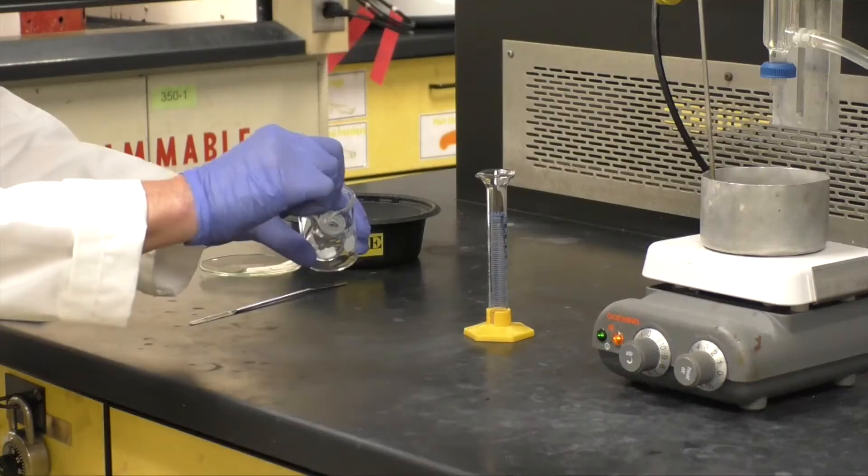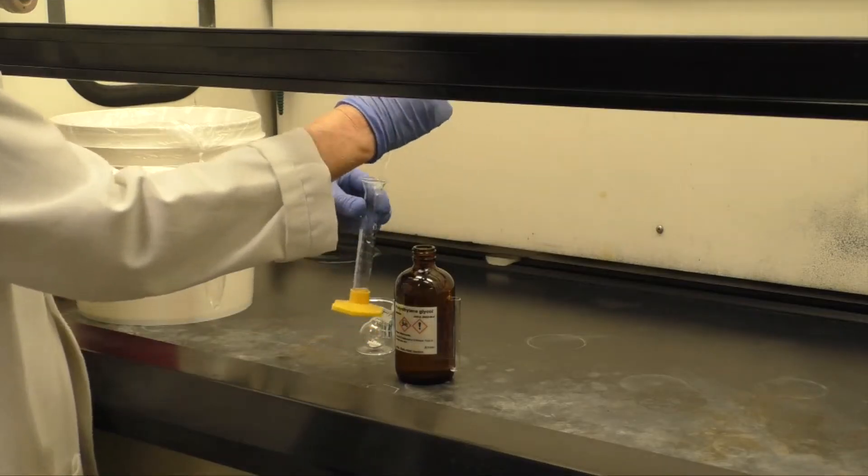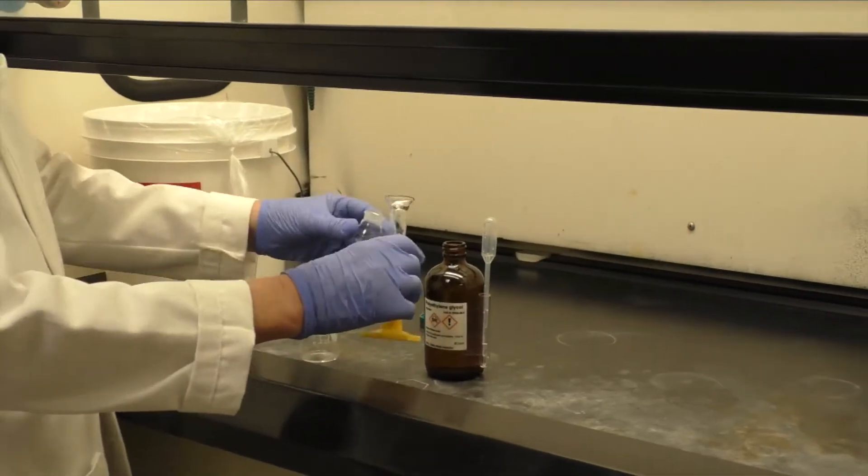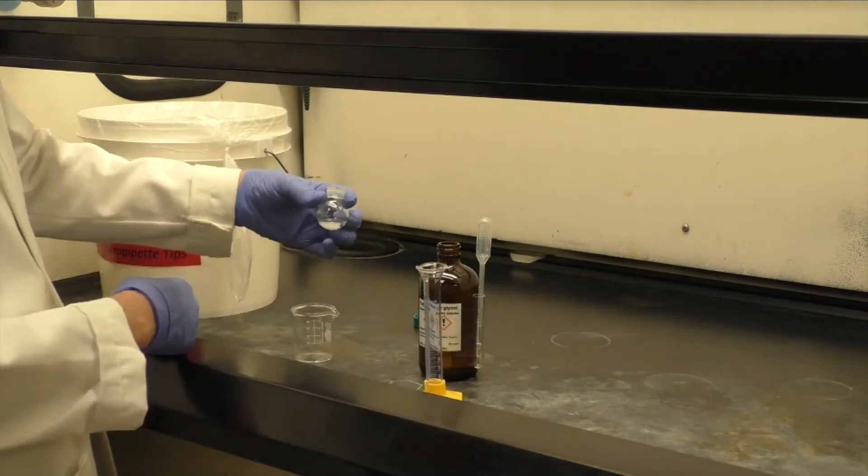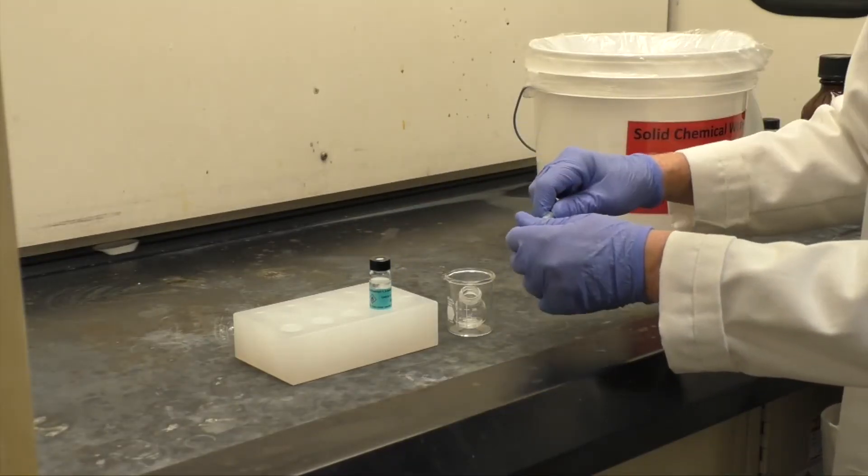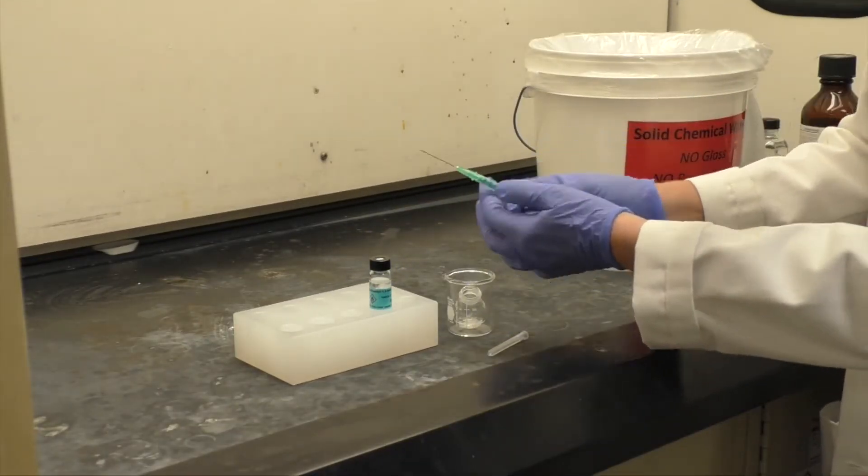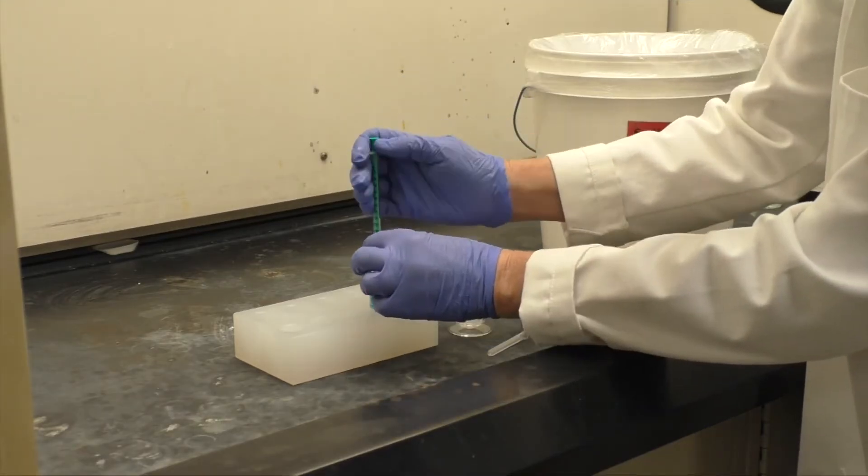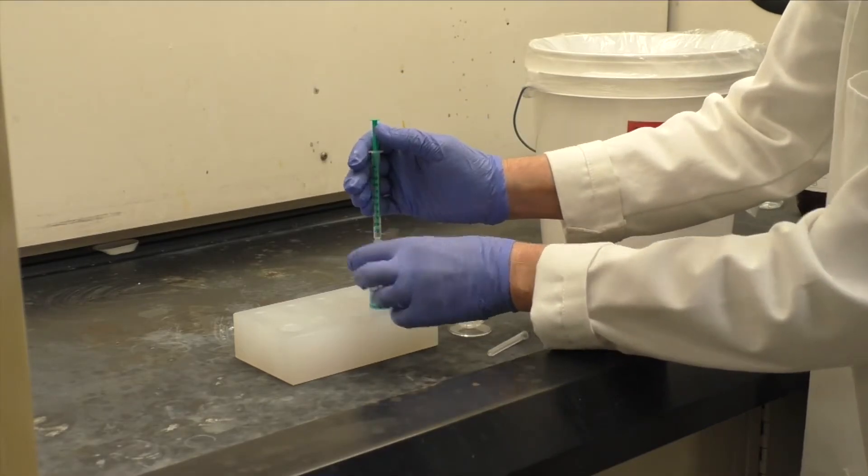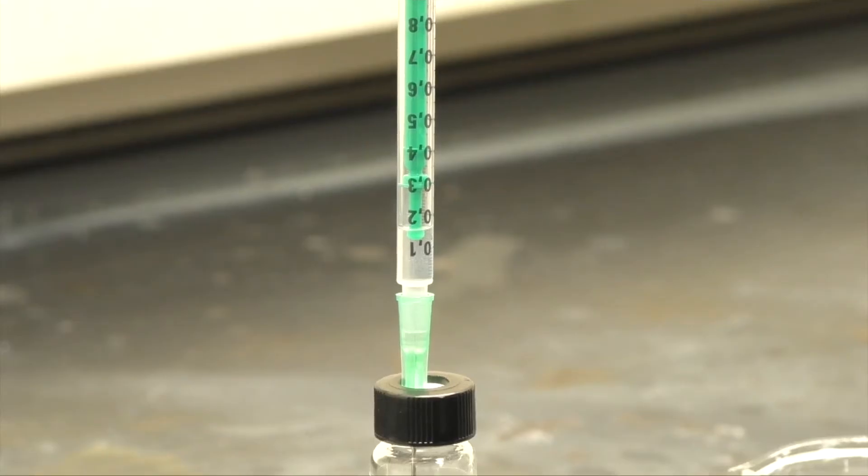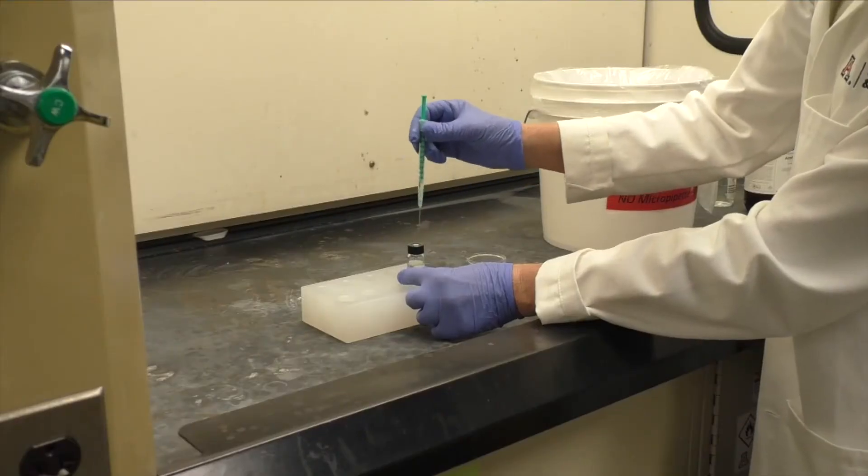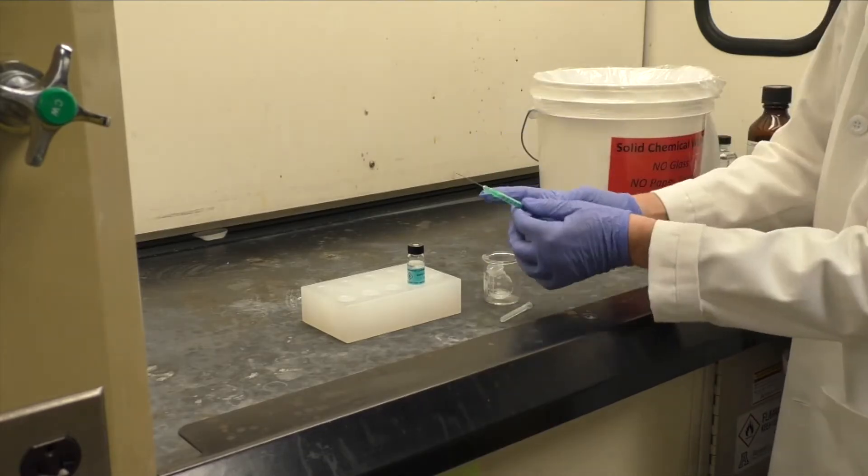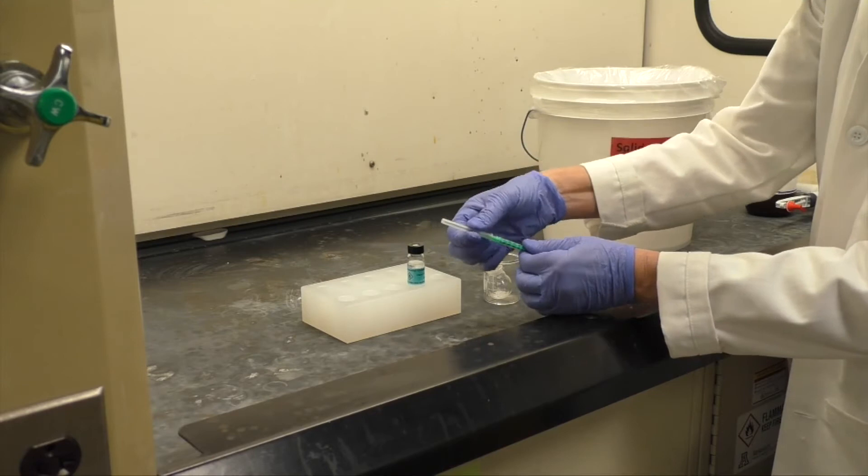Next, add a stir bar and 1 milliliter of PEG 200. Then, using a needle and syringe, add your calculated equivalent of 2,3-dimethyl-1,3-butadiene to the round bottom flask. Be sure to follow all the established safety protocols for obtaining and disposing of your syringe and needle.